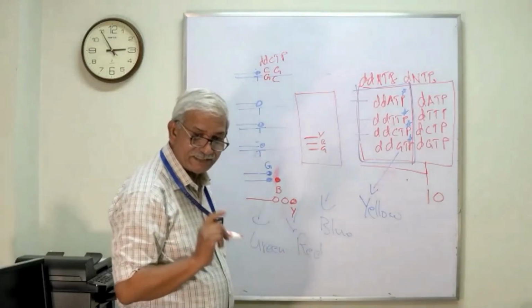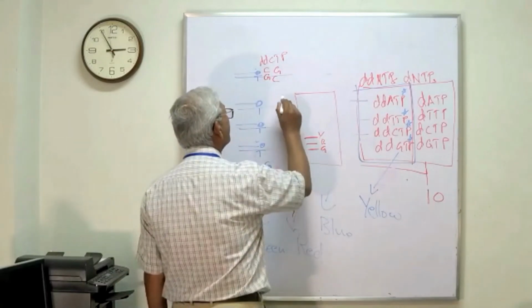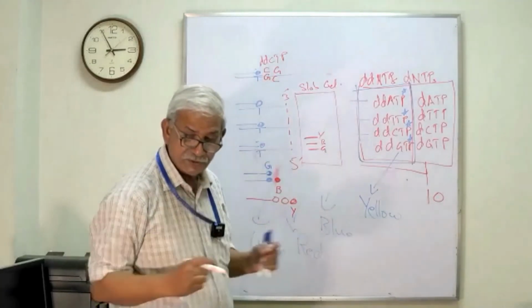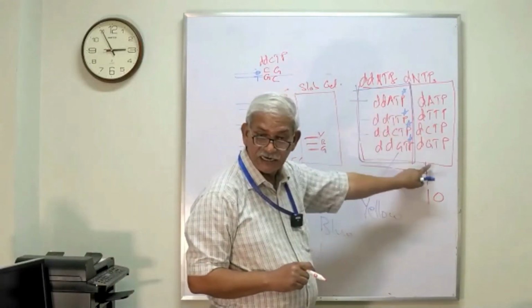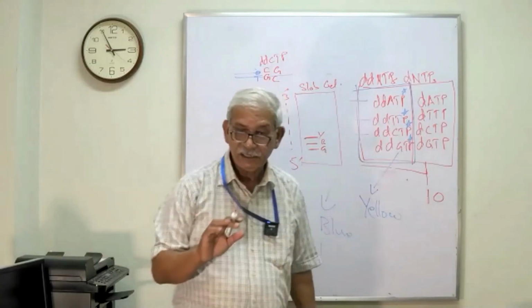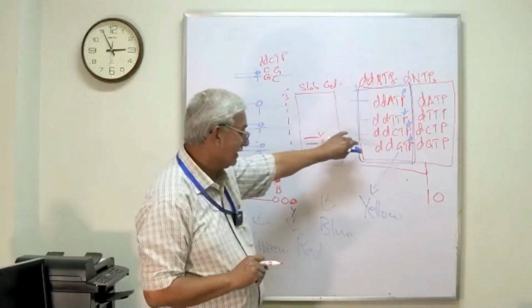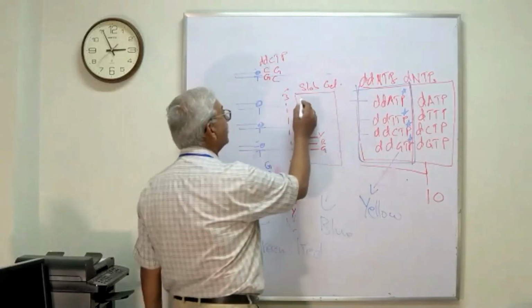And remember, sequence is always read from 5' to 3' direction on a slab gel. This is slab gel. So we had 4 different tubes. In one of the tubes, we had all the dNTPs, and only 1 dideoxy ATP if it was radioactively labeled. If we have 4 colors, we can do a single tube reaction. So in this tube, we have a single tube reaction, and we can run them on a single well.